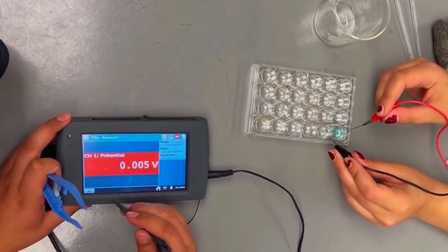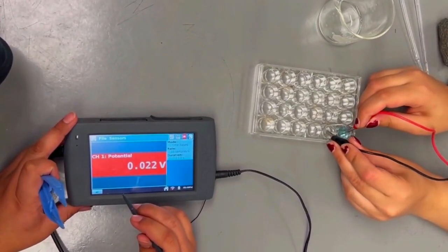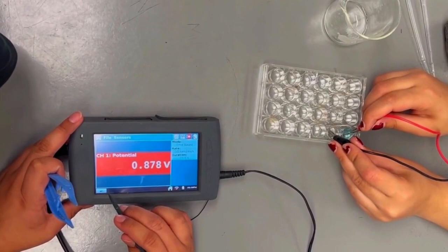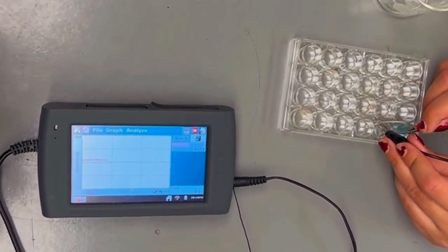Connect the electrodes to the voltage probe. Submerge the electrodes in their corresponding solutions. To begin data collection, press the play button at the bottom of the screen.